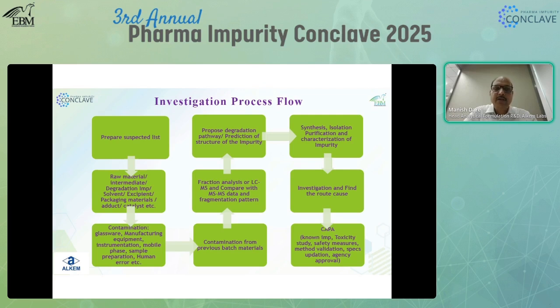analysis, confirming the RT. Once we confirm the RT, we have to do the proper validation of the RS method, spiking this impurity and checking whether it impacts the existing analysis, what the RF and RT would be. If RF is within the 80 to 120 range, then the analysis data need to be evaluated properly and we check the safety risk of the same.